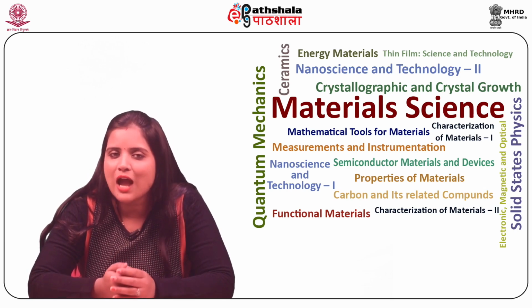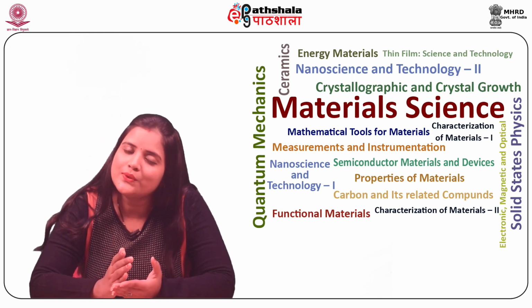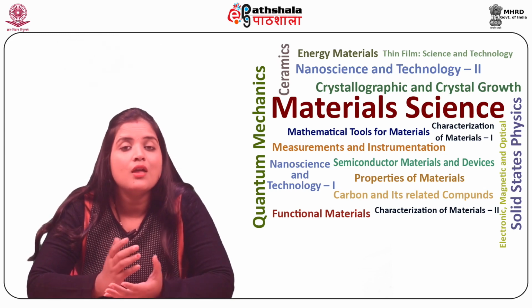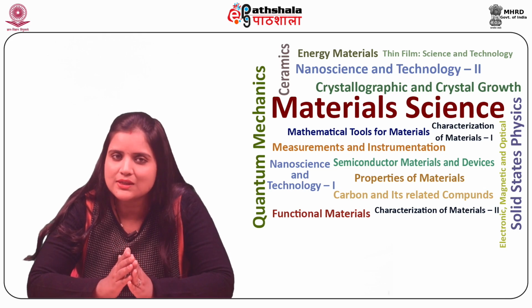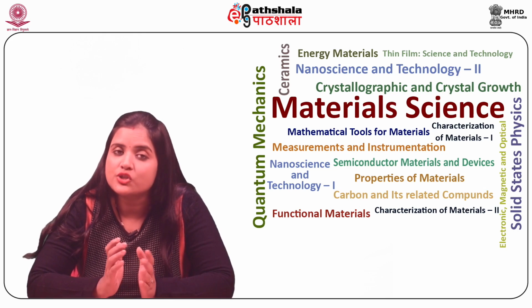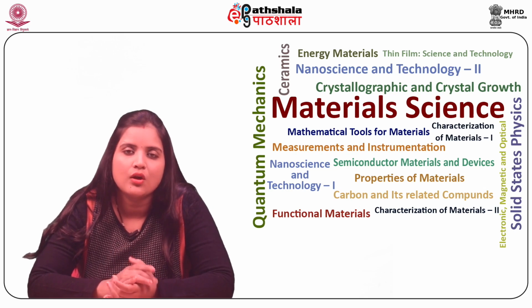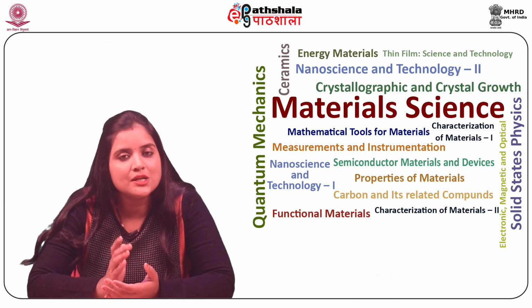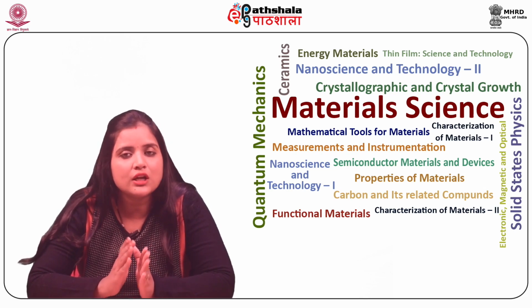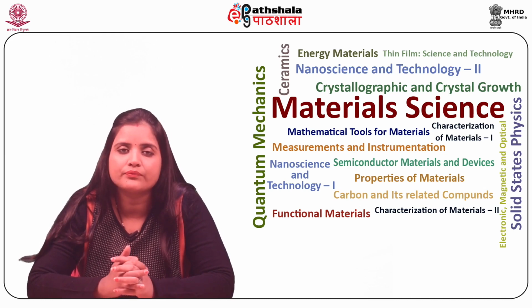After computing the desired field, physical devices can be used to produce and display it. The field produced by these devices propagates in space and reaches the observer, and it creates the picture of the original three-dimensional feature. Owing to the properties and limitations of these devices, there are several restrictions on the three-dimensional light distribution that can be generated by them.